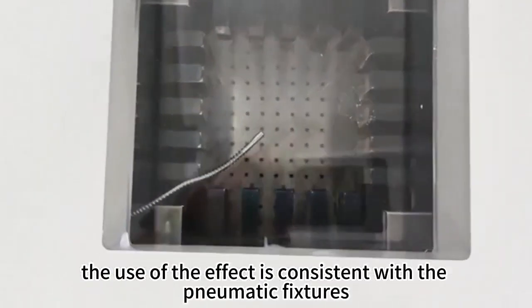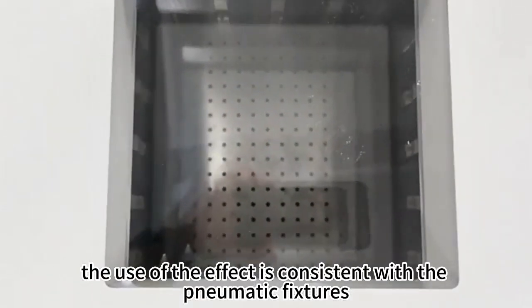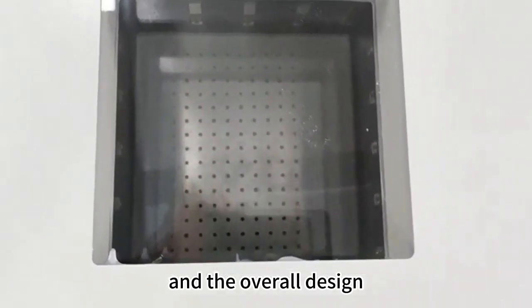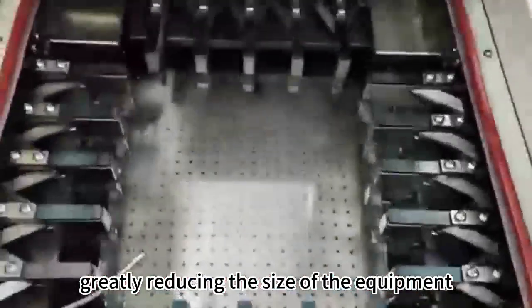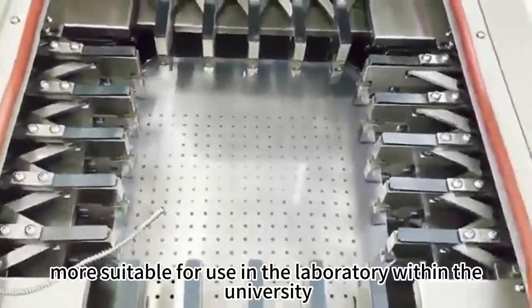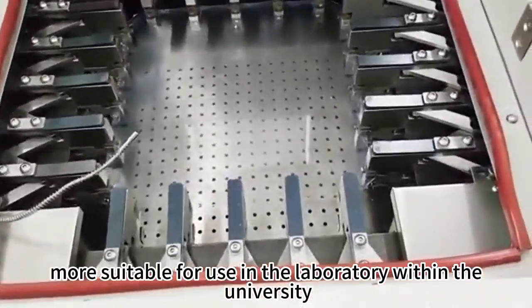The use of the effect is consistent with the pneumatic fixtures, and the overall design of the frame gives up the traditional mobile frame, greatly reducing the size of the equipment, more suitable for use in the laboratory within the university.